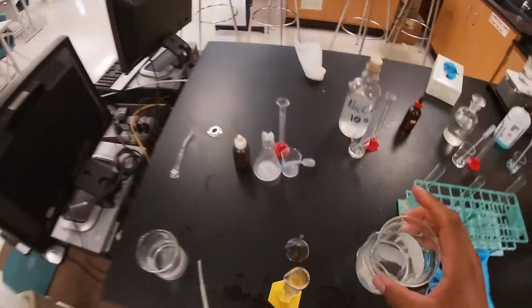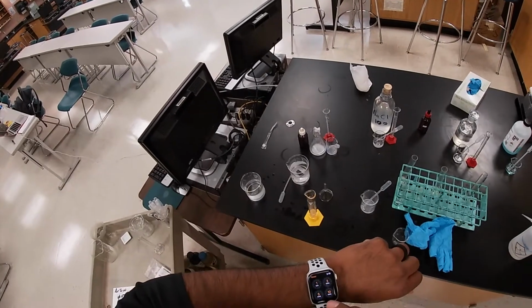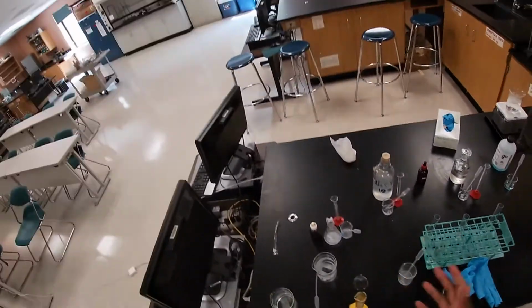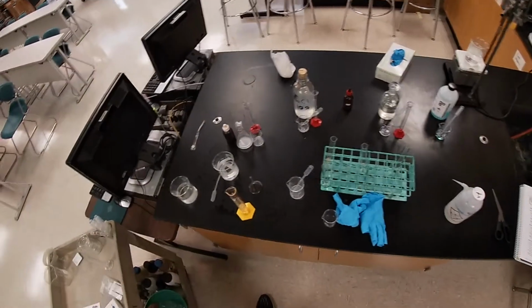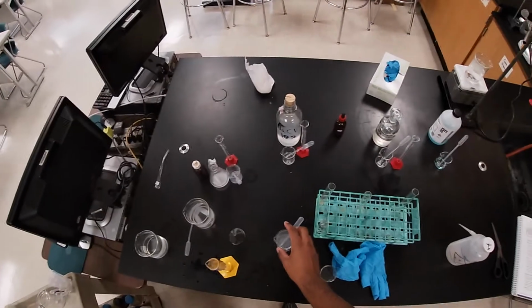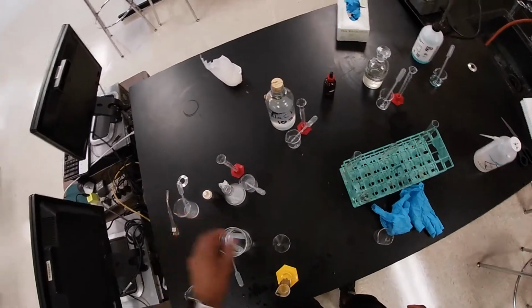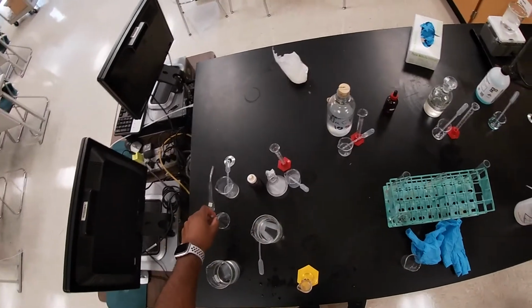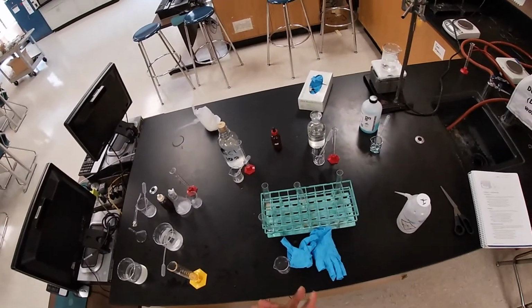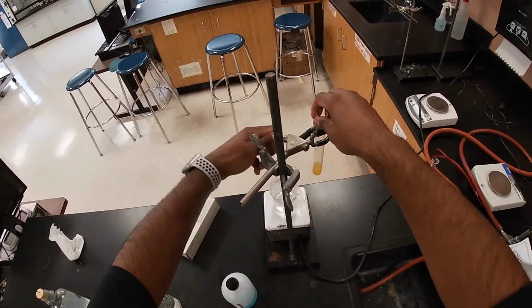And so now we're gonna continue and keep this for about 30 minutes. So we're gonna go ahead and set our timer for 30 minutes. And now we're gonna just wait and test it after those 30 minutes. But now that we have our 15 milliliter solution, the next thing that we're gonna do is we're gonna test it in 3 different containers like we did right here.